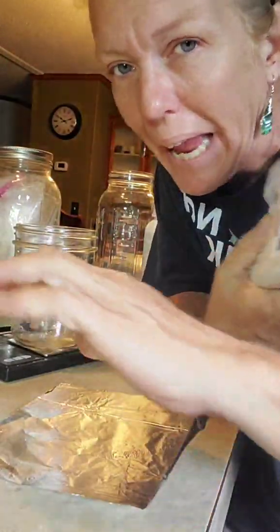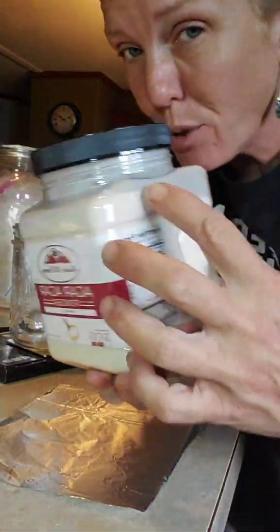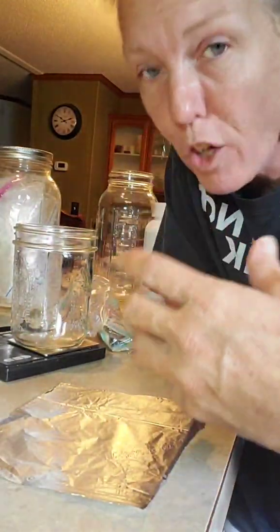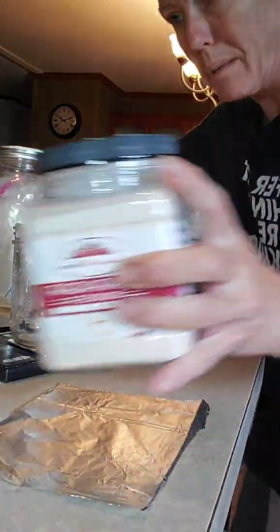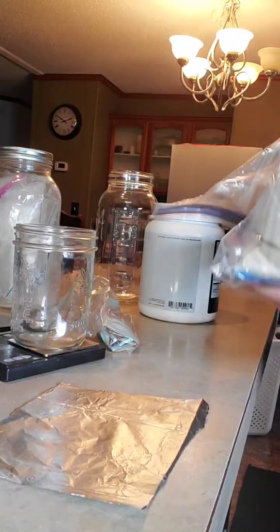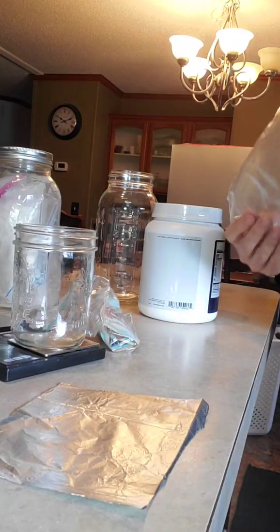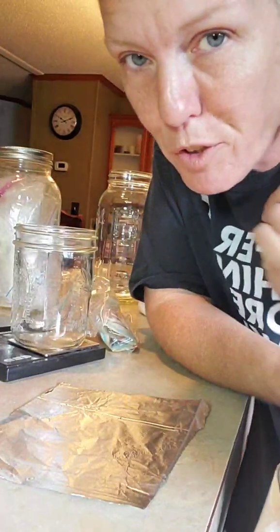So, agar is a generalized statement. Agar is the actual gelatin that you're using. The nutrients are what make your agar plates. So, agar comes in many forms. And one of the best ones, believe it or not, comes from India. Now, there are some agar powders online that have pictures of cordyceps growing on them, and they make you think that they're the best of the best.